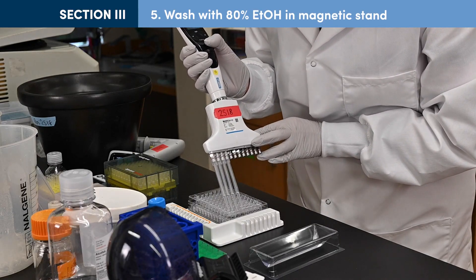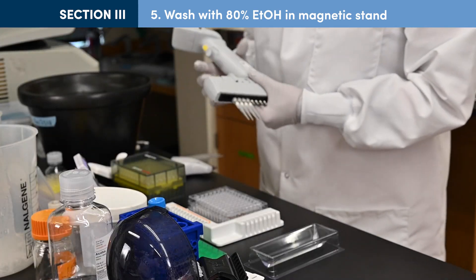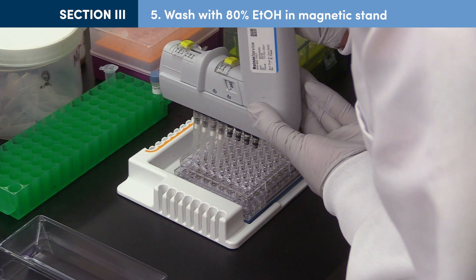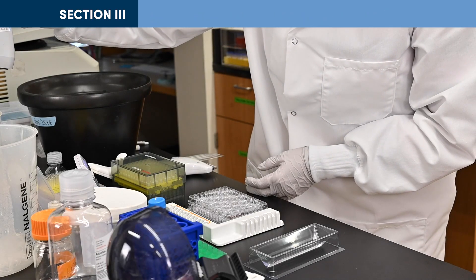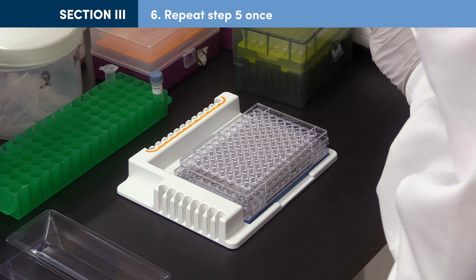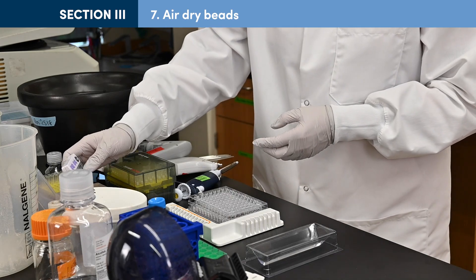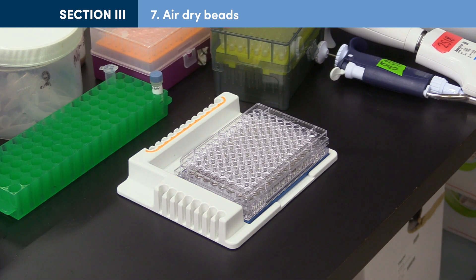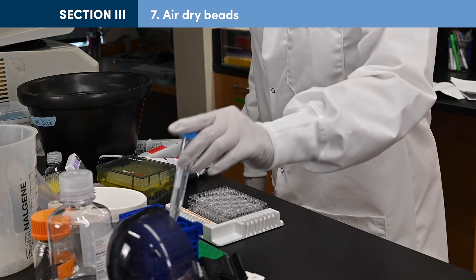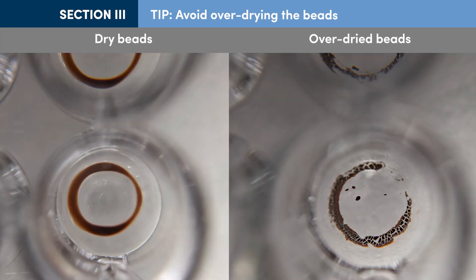With the tube in the magnetic stand, slowly add 200 µL of 80% ethanol to each tube. Incubate for 30 seconds, then carefully remove as much supernatant as possible while being careful not to disturb the beads. Repeat for a total of 2 washes. After the second wash, remove as much liquid as possible without disturbing the beads. With the tube still in the magnetic stand, allow the bead pellet to air dry for up to 5 minutes at room temperature. Proceed to the next step when all visible liquid has evaporated but the beads still have a glossy appearance. If the beads start to crack, they are overdried and may have lower recovery of DNA targets.